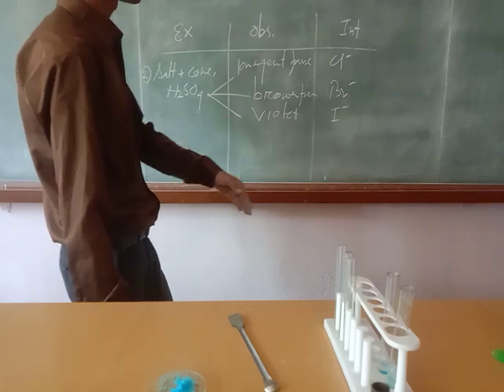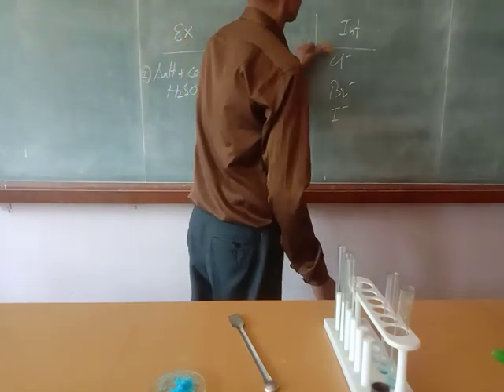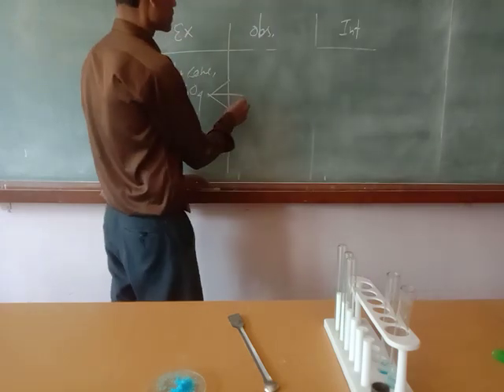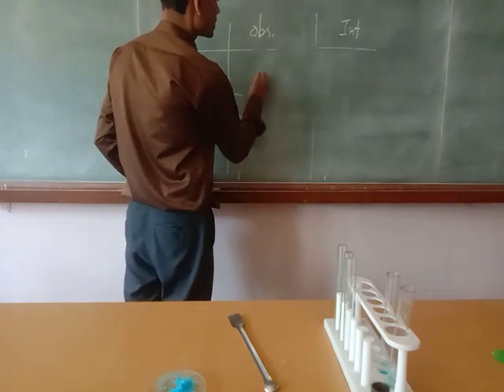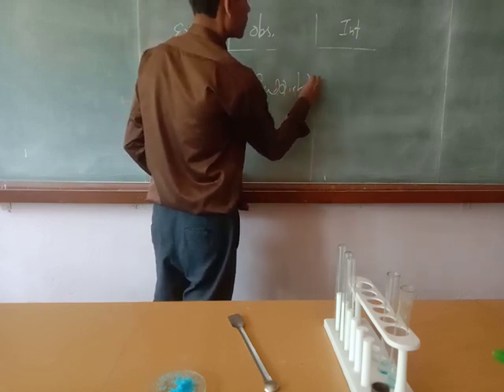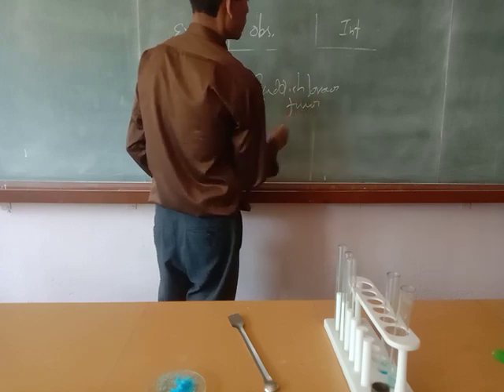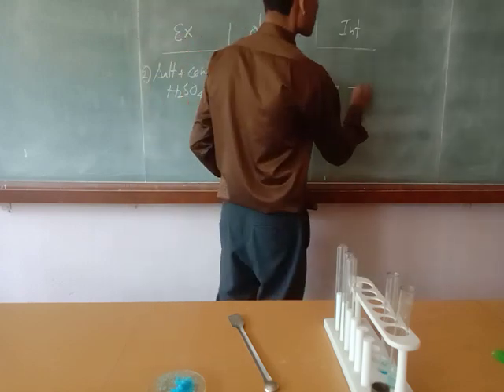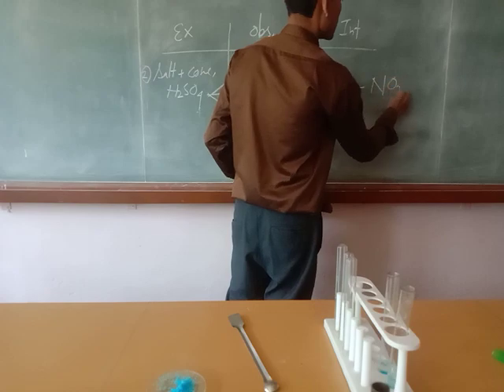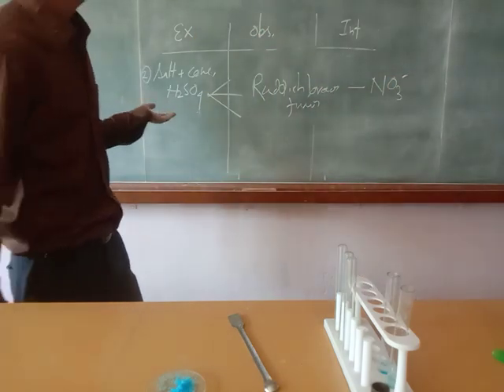After heating with copper turnings, if you observe reddish brown fumes, only then it indicates nitrate, NO3 negative. So again, after heating there is no observation.